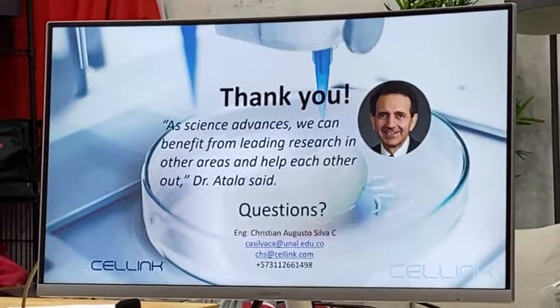You say, okay. Can I just ask to stop about your printers? I was very interested. We also have one of our key successes is that we actually do make our own printers. We have one of our people who does RepRap printing and he's there, he can service it. I don't think we would have been as successful had we not had someone in our community who already was familiar with 3D printing. How do you guys actually make all the 3D printers yourselves?